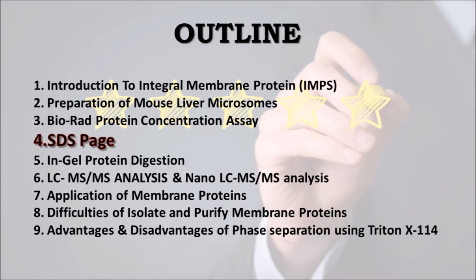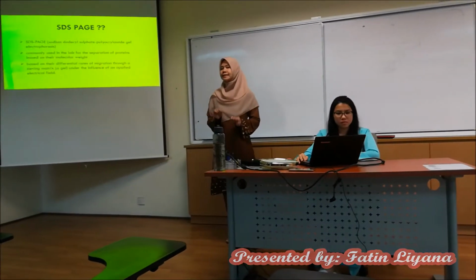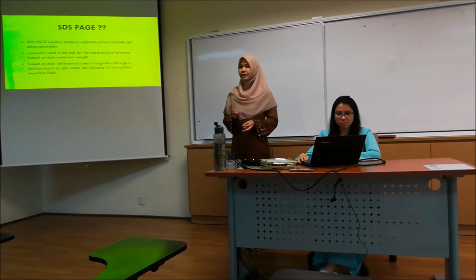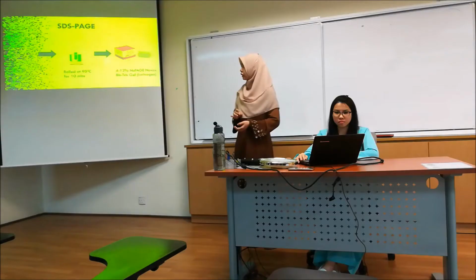SDS-PAGE is sodium dodecyl sulfate polyacrylamide gel electrophoresis, which is commonly used for the separation of proteins based on their molecular weight and their differential rate of migration through a sieving matrix under the influence of an applied electrical field. Based on our reference, I will explain in detail the method of SDS-PAGE.